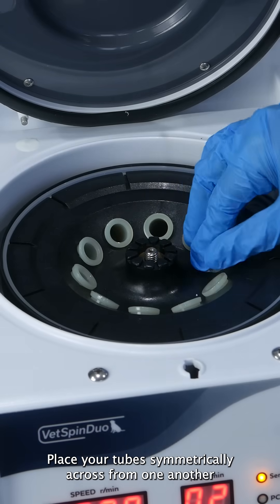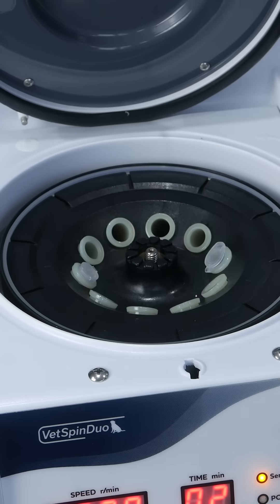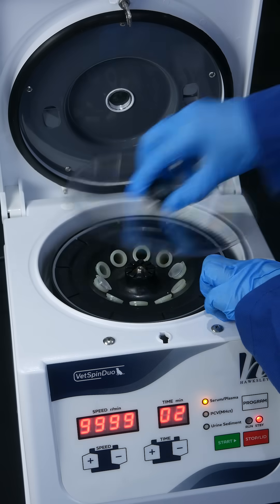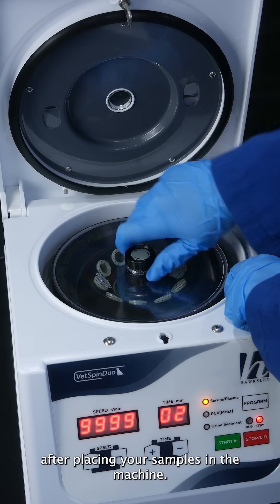Place your tubes symmetrically across from one another to maintain balance within the rotor. Before closing the lid, it is integral to screw the rotor lid back on after placing your samples in the machine.